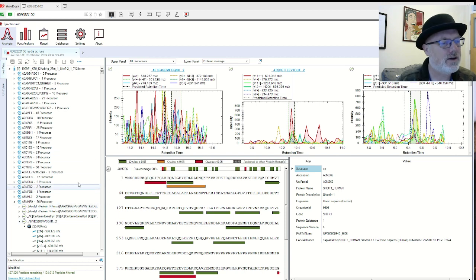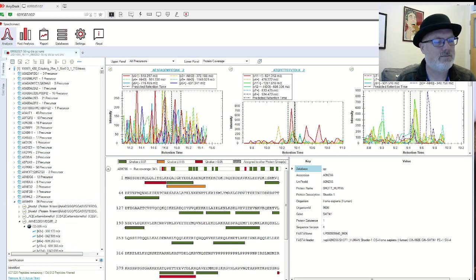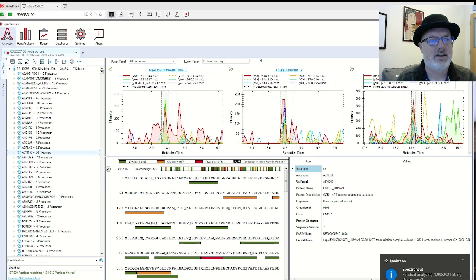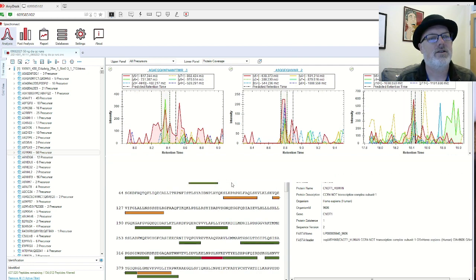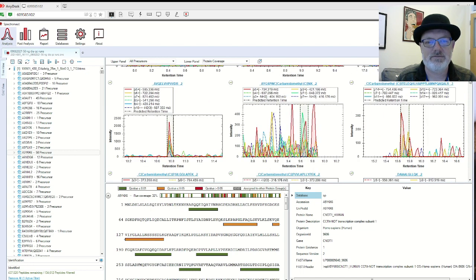I don't even remember where this plot is anymore. Let's see. All right, so this only takes a couple minutes. Hey, it's done already. Cool. All right, so let's see if some of this data, some of them still don't look very good. Let's see, but this, I don't know, I guess so. Sometimes the computer does a better job than your eye, depending on the algorithm.